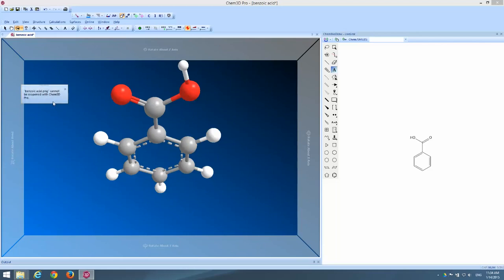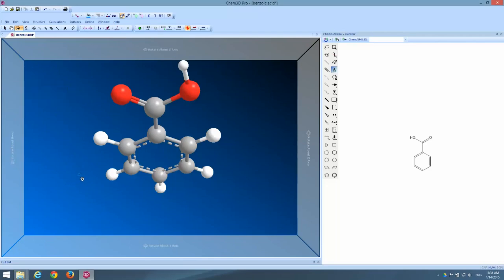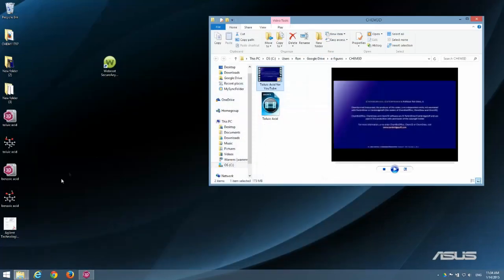Chem 3D is warning me, hey, you can't reopen PNG files in this program for editing. And that's okay, because I've already saved my Chem 3D formatted file. Now I'm ready to let go of this program and go back to my desktop.